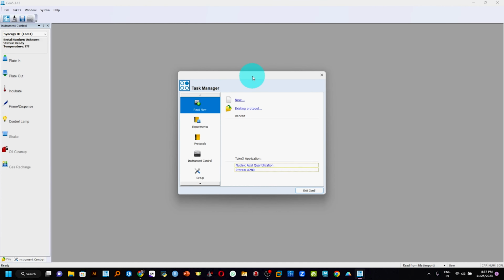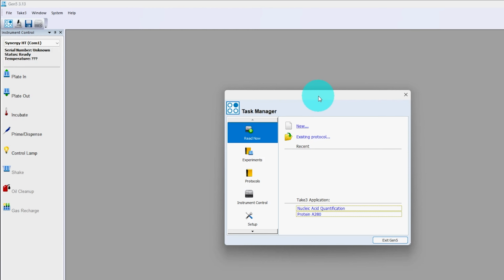Today I am going to show you how you can create a setup for your ELISA plate reader if you are using Gen5 software along with a BioTek ELISA plate reader instrument. Today I am going to show you the procedure setup, plate setup, data analysis setup, and data export, with an example of an ELISA plate experiment having the standard, sample and blank.